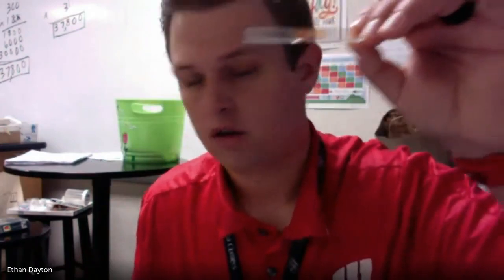But I will be searching those and showing them to you, sharing my screen. Okay, but then we will look at an onion cell or onion cells underneath a microscope right here. I have a microscope cam, and I'm hoping that it works. Okay, good with that? Zach, we just went over it. I will have to meet with you and talk with you about where to find it.